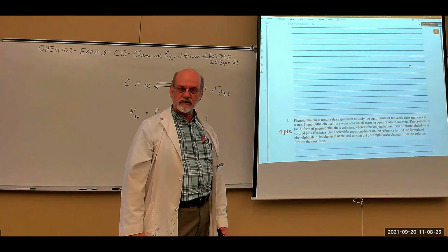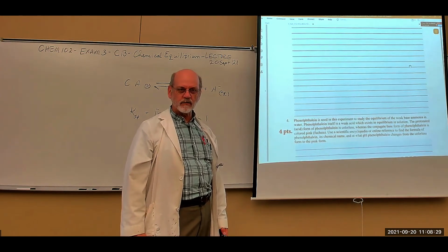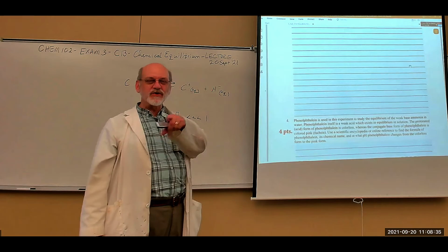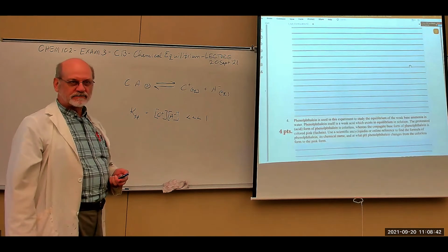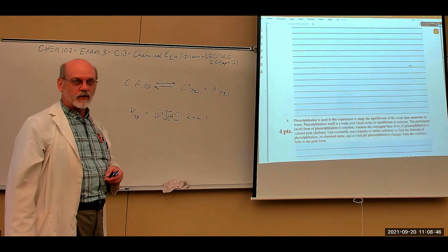We did a titration to determine the molar mass of an acid by titration. Didn't we do that first semester? I think so. Yeah. Oh, we're going to do it again, aren't we? For you at Greenbrier. Yeah. But we use phenolphthalein as our indicator. Okay, those three items will answer that question.